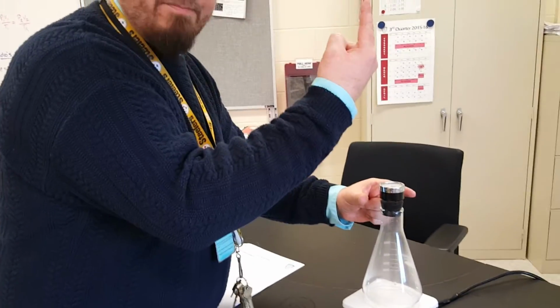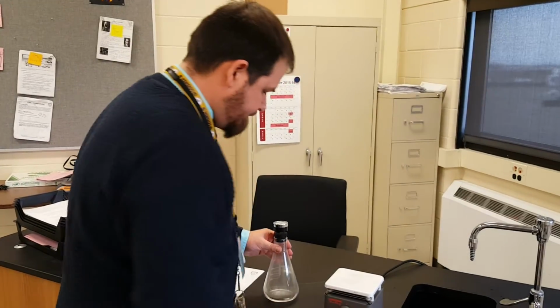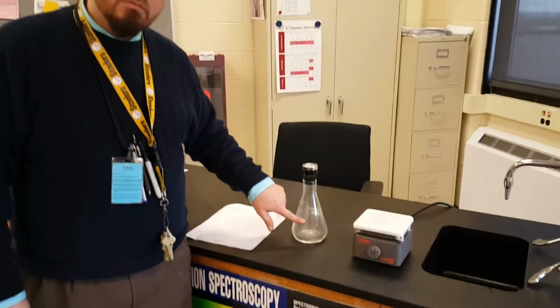Because if the pressure gets too high, this thing's going to pop off. The gauge is going to break, and we've got one. So don't ruin it for everybody. And so you'll put that back down on the table when you're done. It won't shatter. It's not going to heat up too much because it's special glass, only been there for 2 minutes. Right, it's special glass, a little bit more heat resistant than most.